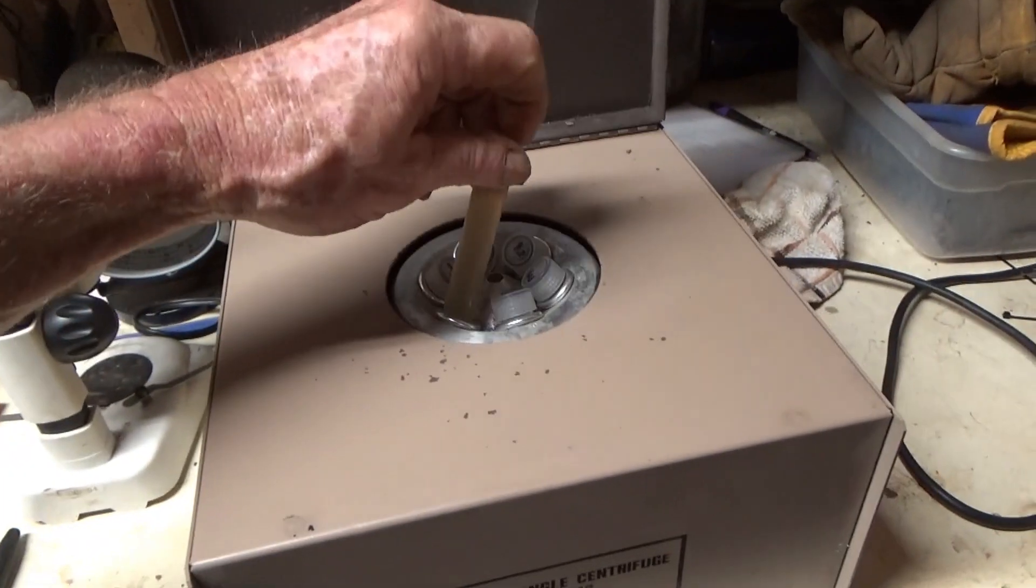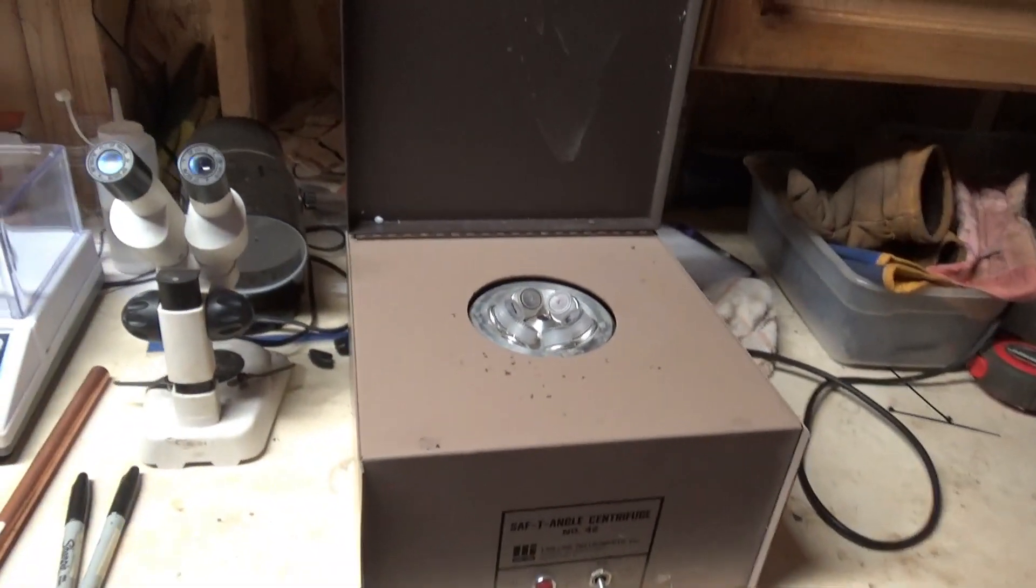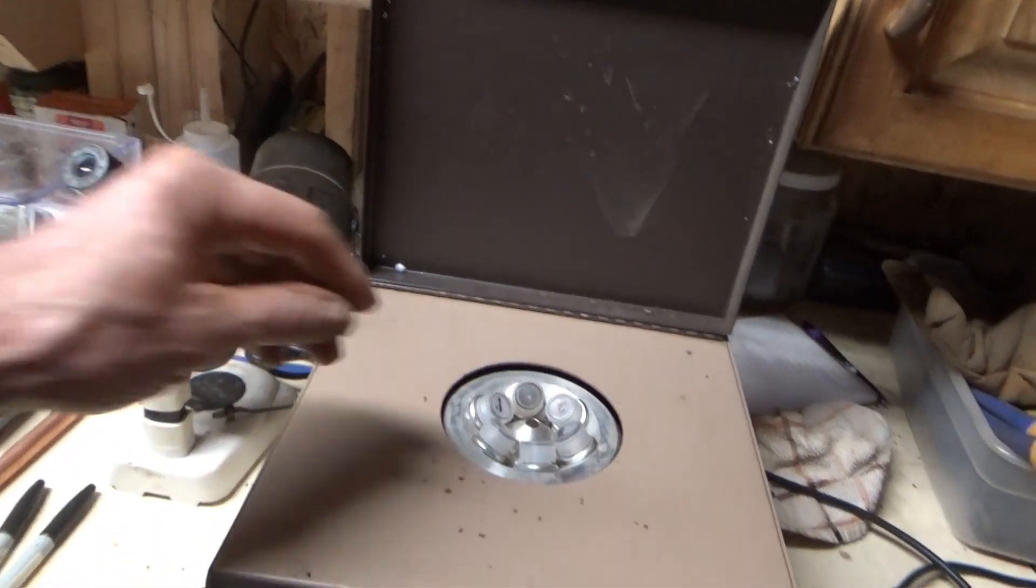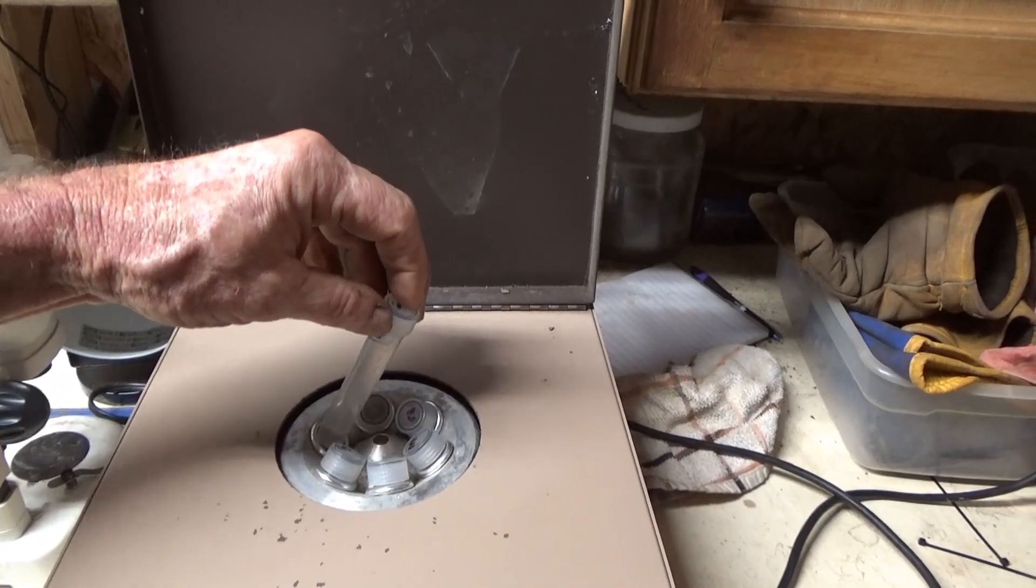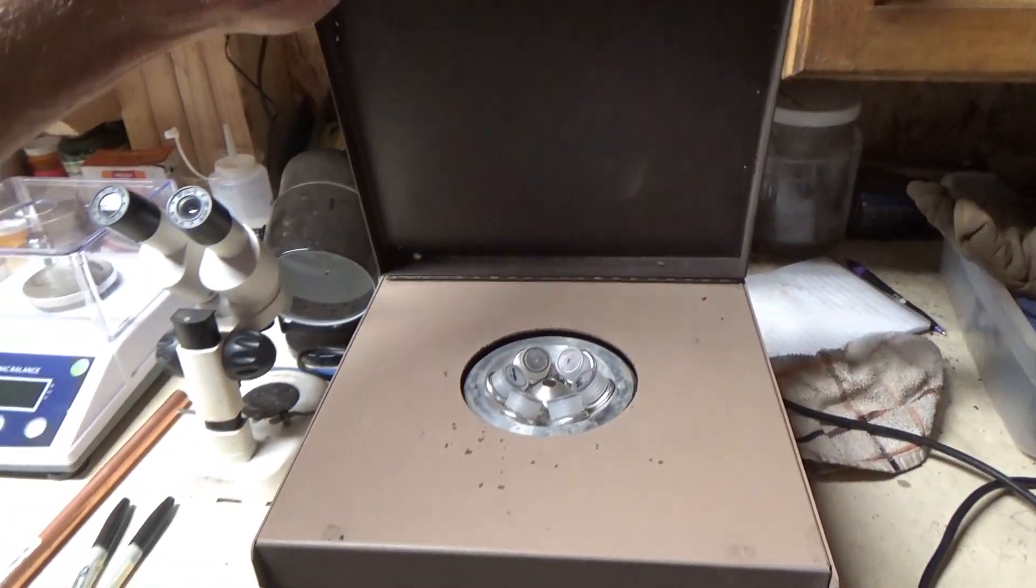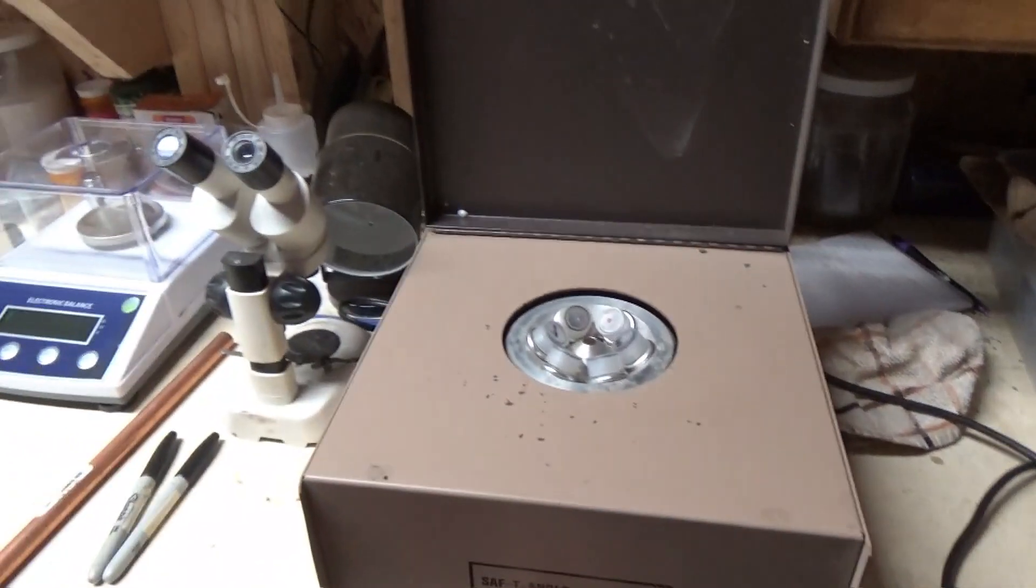The centrifuge spins at a high speed and it's in many ways a lot more efficient than filtration because you don't need filter papers or anything like that. You just take the container, stick it in there, spin it and it turns clear.